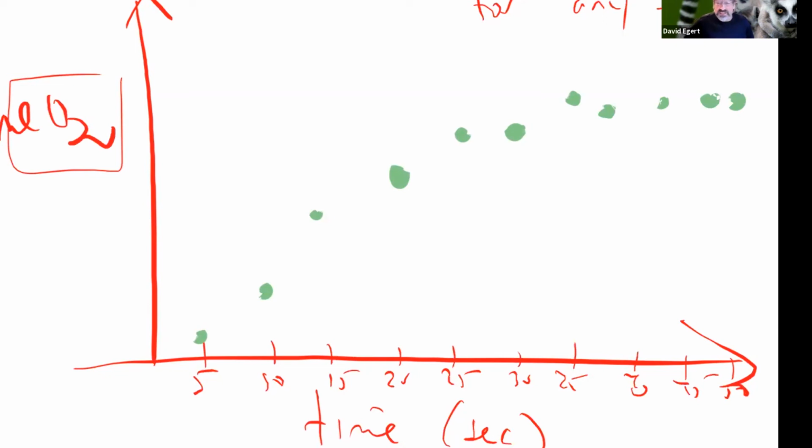It's never going to be beautiful, but in general, it's kind of going up and then kind of dies and then kind of gets flat. So this is a typical trial. And what is happening here as it's flattening out?